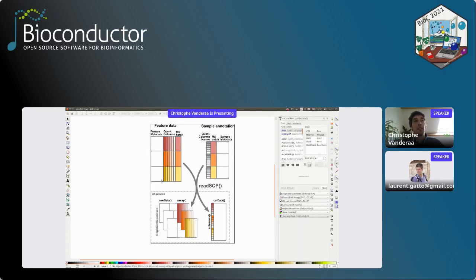Here on the left is an illustration of a data table as it would come out of a pre-processing software. Typically you have feature metadata, all sorts of metadata generated when doing the identification. For instance, the peptide sequence, the charge of the ion, the mass of the peptide, and the confidence we have in the matching. Then we have the quantification columns. Remember, per run we can have up to 16 samples, so up to 16 quantification columns. And then finally, we have the MS batch, basically the name of the file where that PSM was retrieved. And you can have several files.